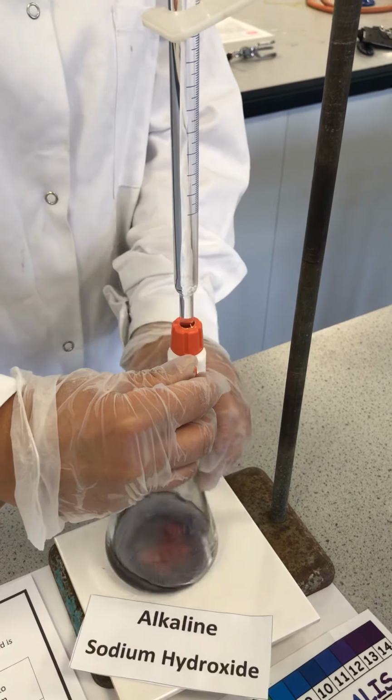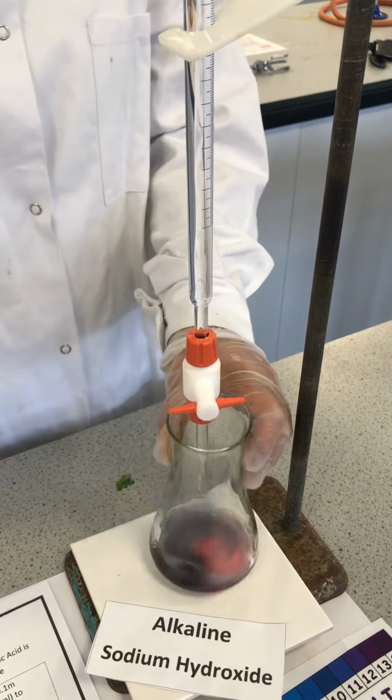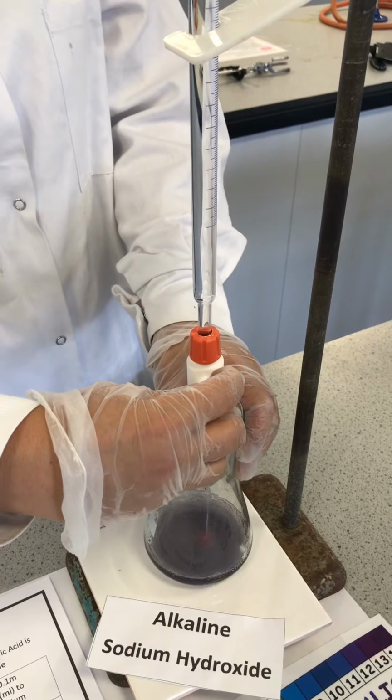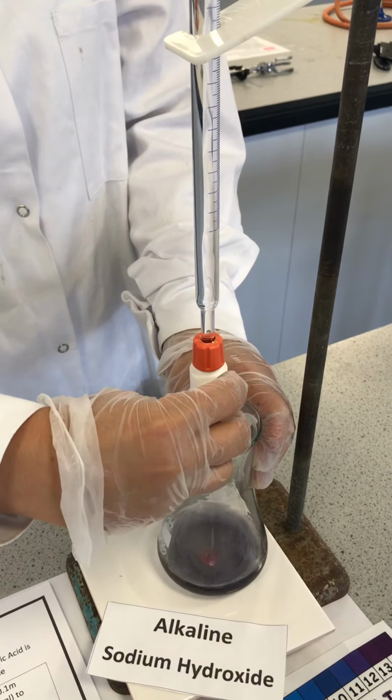We will see the different color changes. Please refer to your pH chart before our solution is completely neutralized and we have made salt and water. As you can see, it has started to change color.